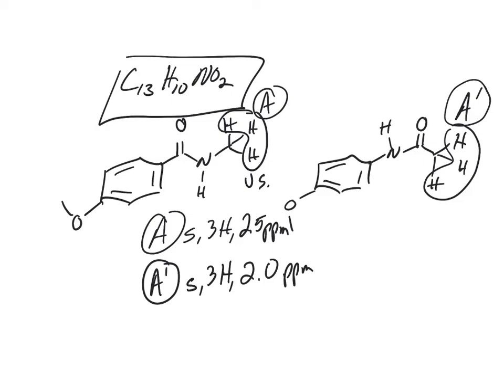So that would be different. So that's the way you're going to differentiate these two possibilities. It's really looking at the frequencies from that table. Somebody might ask, well, wait a second, this NH, it should be able to do splitting with A. That'll be a doublet. Do we do splitting with NHs and OHs? No. NHs and OHs don't do splitting.